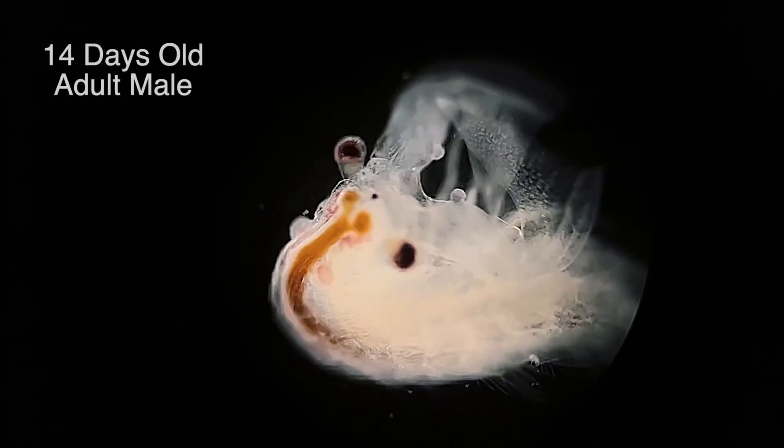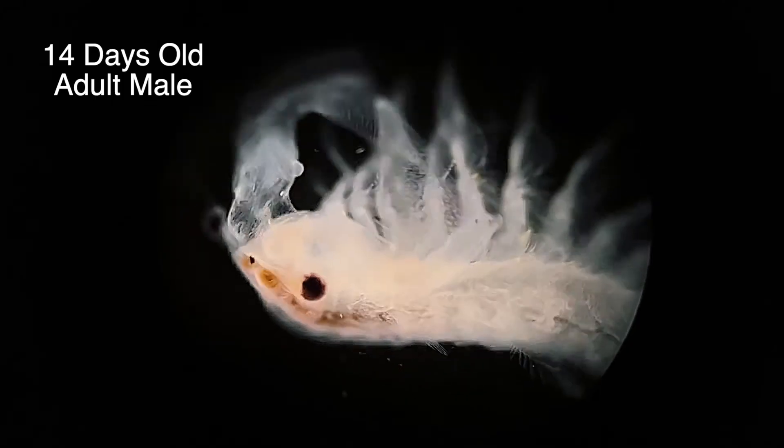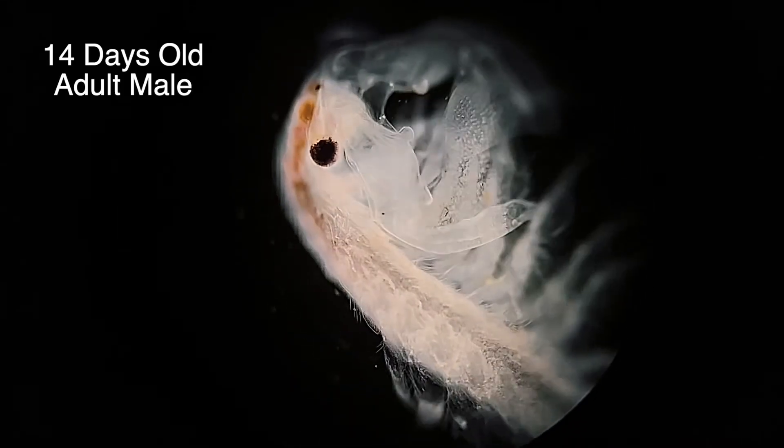This is quite different to the adult male, whose body doesn't get quite as long but is easily distinguishable by the enlarged frontal antennae which have now developed into a pair of claspers that he'll use to hold onto the female while mating.